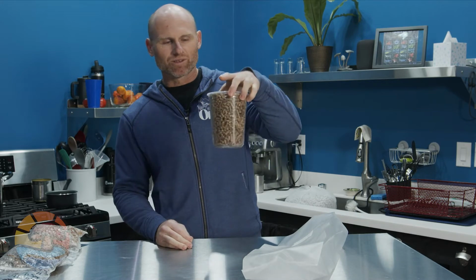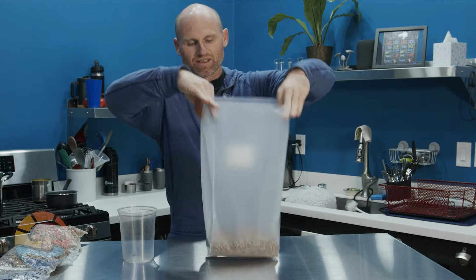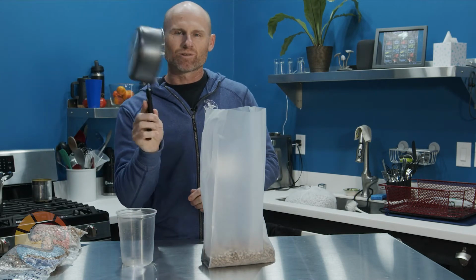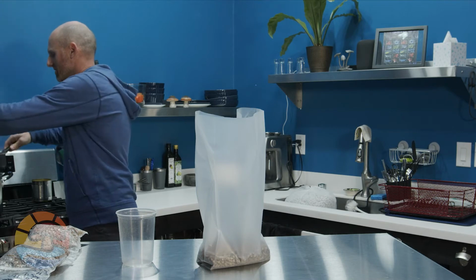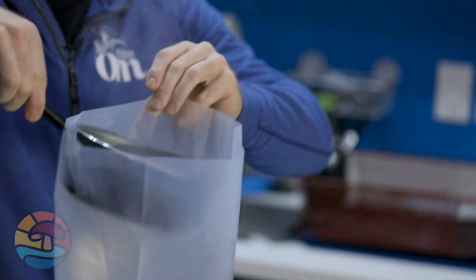And what we're going to do, we're going to take 4 cups of hardwood pellets. We're going to stick it in our bag, just like that. So this is a quart deli cup of pellets. And we're going to be really careful. And so this is a 4 cup, 1 quart little saucepan. Be really careful. We're going to take some hot water, kind of slide it inside and pour it in.